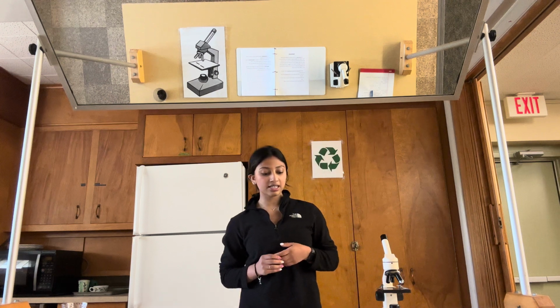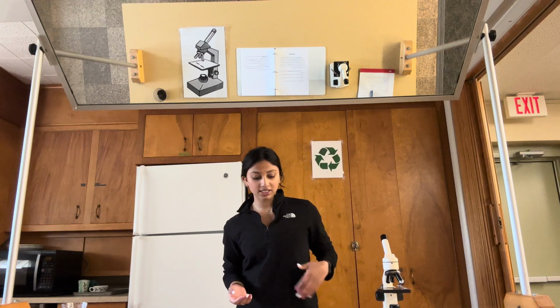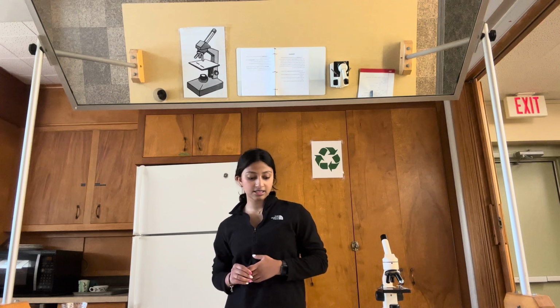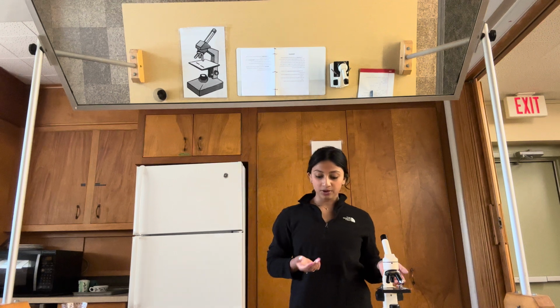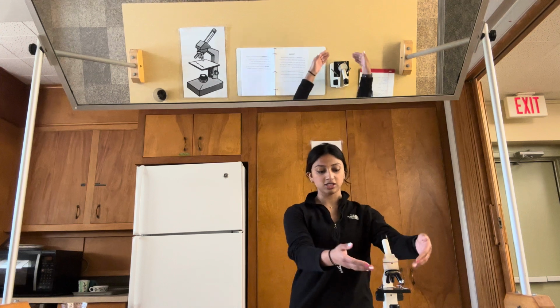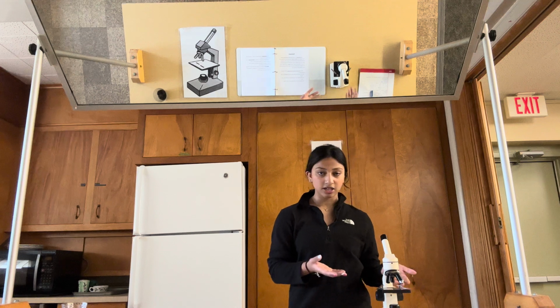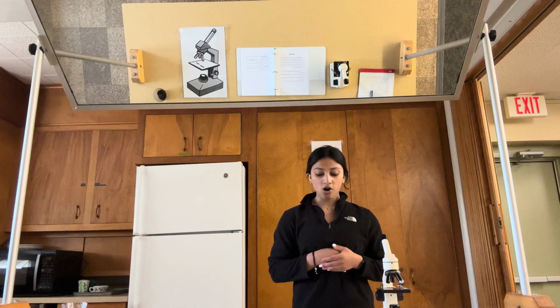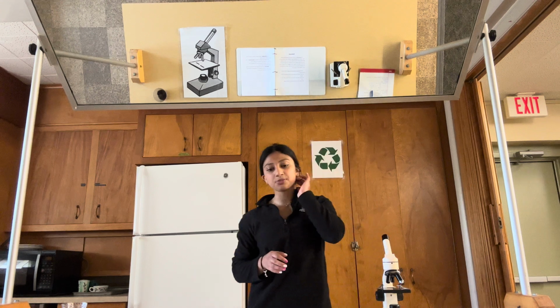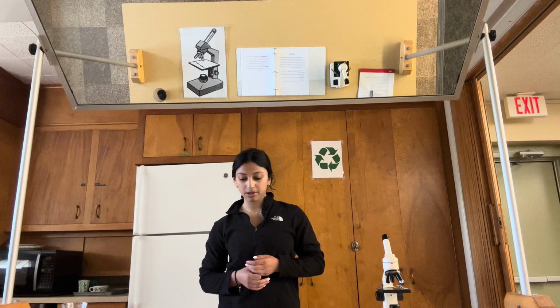It can help us see tiny objects like grains of sand, small insects, and bacteria up to 1,000 times their actual size. Some things we should remember when using a microscope is to never touch the glass part of the lens with our fingers. Always keep your microscope covered when not in use, and always carry a microscope with both hands. The icebreaker today entails a walkthrough of the different parts of the microscope.